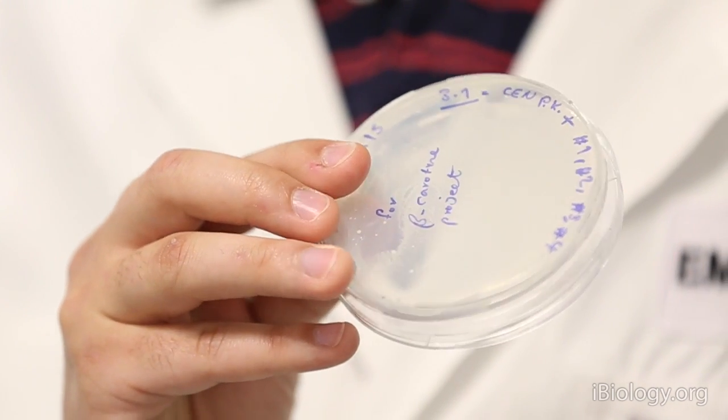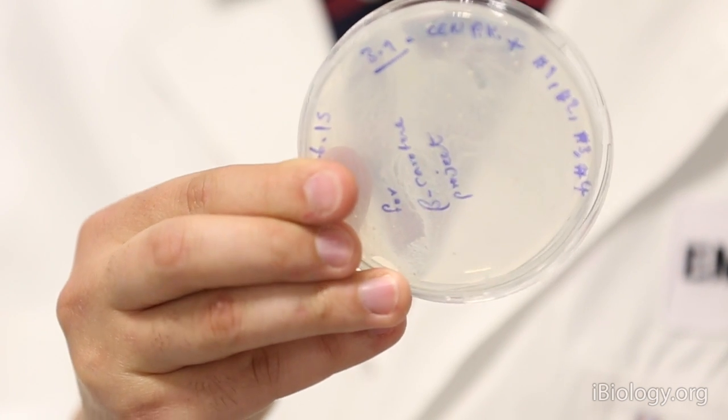Joana explained how to amplify the parts that we want to integrate into our new organism. And Gita, at the end, explained to you how to assemble them to a full construct. Afterwards, she transformed them into the cell. 3 days later, colonies appeared on the plates. These colonies we picked and moved them into a liquid culture that grew at 30 degrees for 3 days.